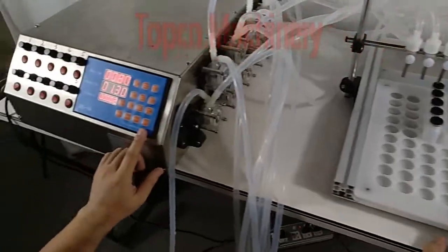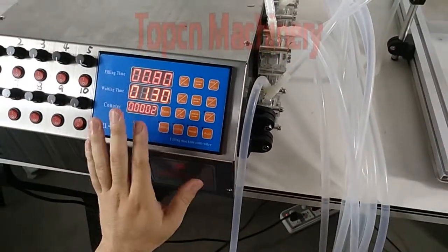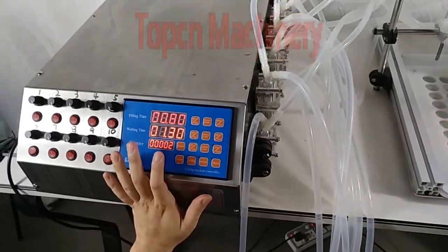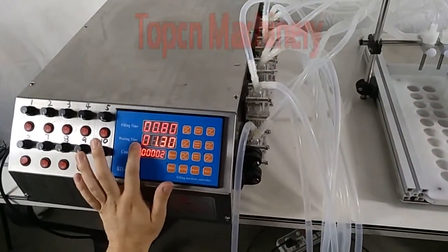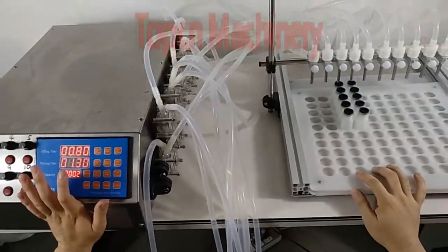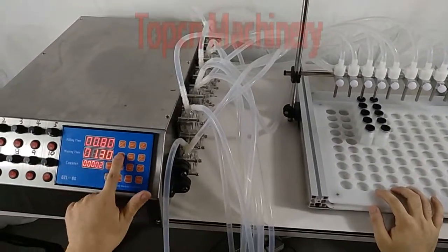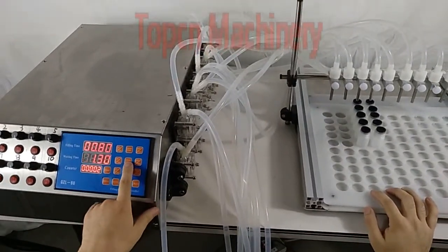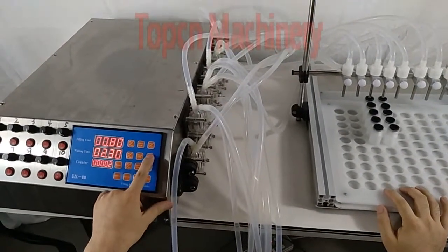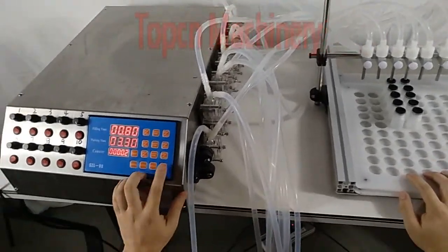Let's try the automatic settings. Simply press auto. If at the beginning you're not comfortable using this, you can set the waiting time longer so you still have enough time to push the plate. Let's try auto.